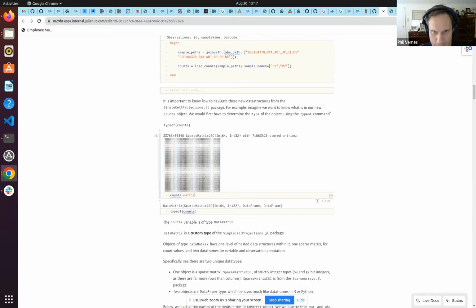It has a completely different intention. And that's consequential when it comes to the computation side. And I'll show you some benchmarks from the JuliaCon slides that illustrate a little bit of forethought on the developer side: by using generic functions and multiple dispatch, he was able to make this thing fly, especially compared to Seurat specifically.